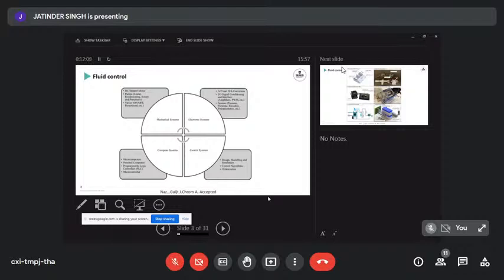Does it need to be switched at a certain time, or when a certain pressure is achieved, or when a certain amount of color is being produced? That's the way the whole system is interacting, and a little bit of understanding of those kinds of schemes helps you talk with electrical engineers.